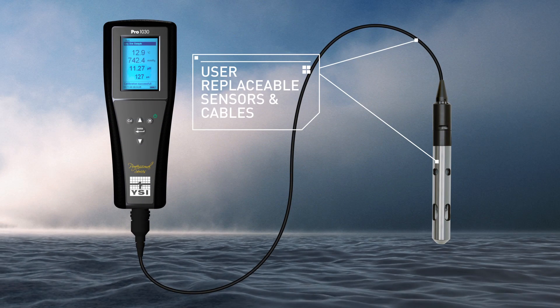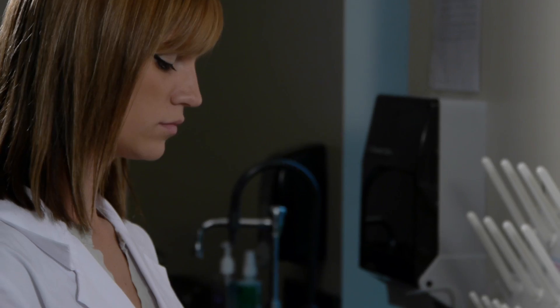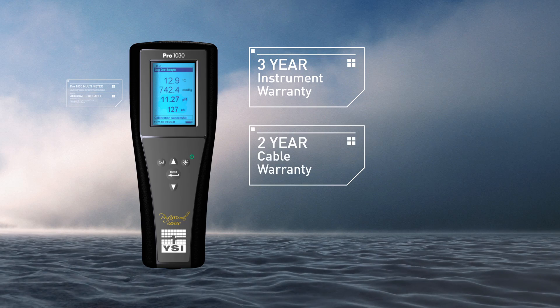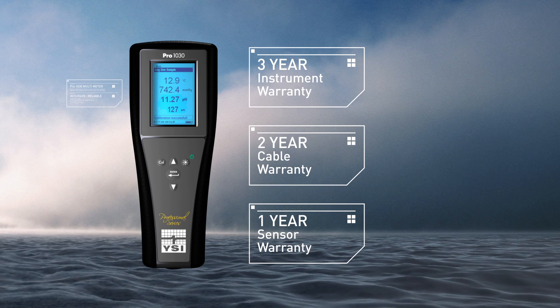User-replaceable pH or ORP sensors and cables. Conductivity cell built-in. 3-year instrument warranty, 2-year cable warranty, and 1-year pH and ORP sensor warranty.